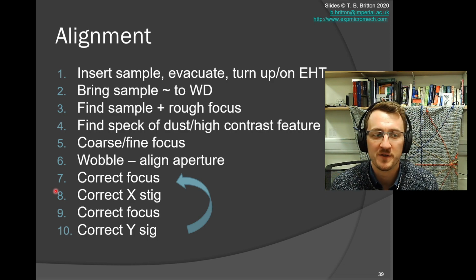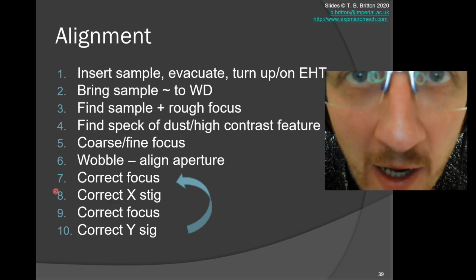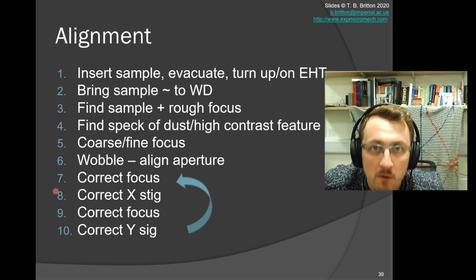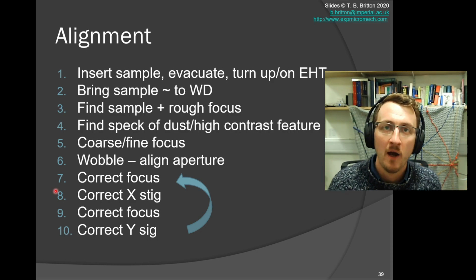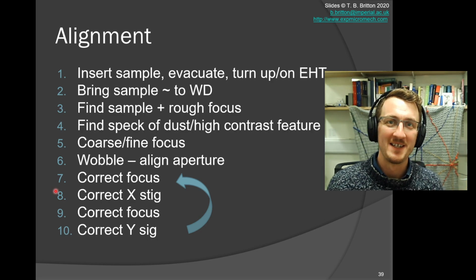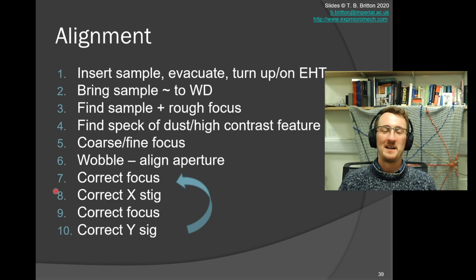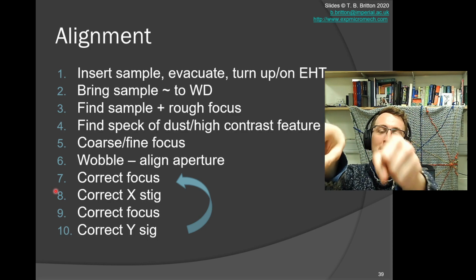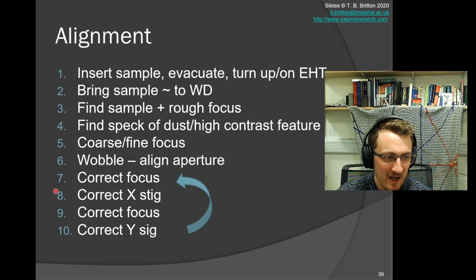New users will move really close to the screen, and they'll try and see this sort of thing, and you'll miss the big picture. So you often want to step a bit further back. As a supervisor, it's very easy to see this because I'm often standing behind and I can see exactly what's going on and I have an experienced eye. But use arm's length microscopy to start off with for these problems.